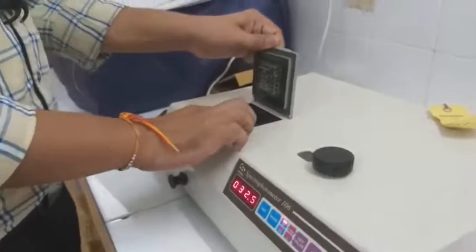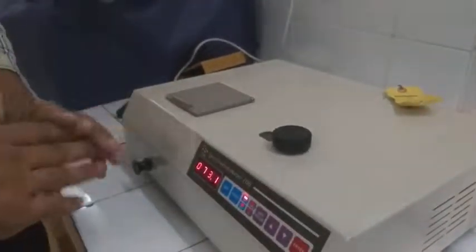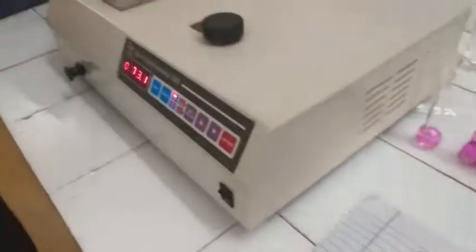Fill the sample solution in another cuvette. After filling, clean the surface of the cuvette and hold it towards the rough surface, then place it in the cuvette chamber of the sample compartment. Now we have to set filter number four for the 390 to 630 nanometer wavelength range. We are going to scan at 500 nanometers wavelength, so we make a table recording: serial number, wavelength in nanometers, and absorbance. Now we start scanning at 500 nanometer wavelength at 10 nanometer bandwidth.